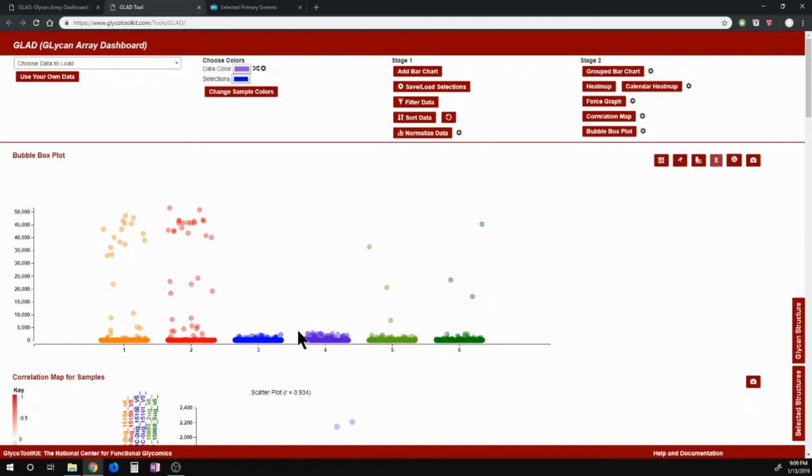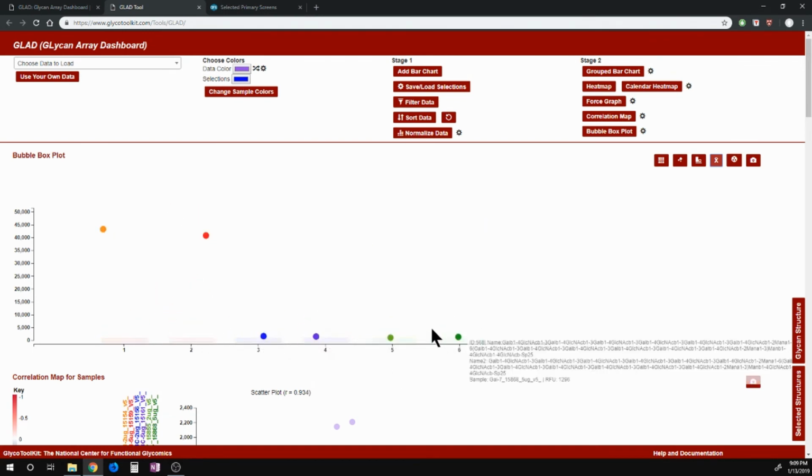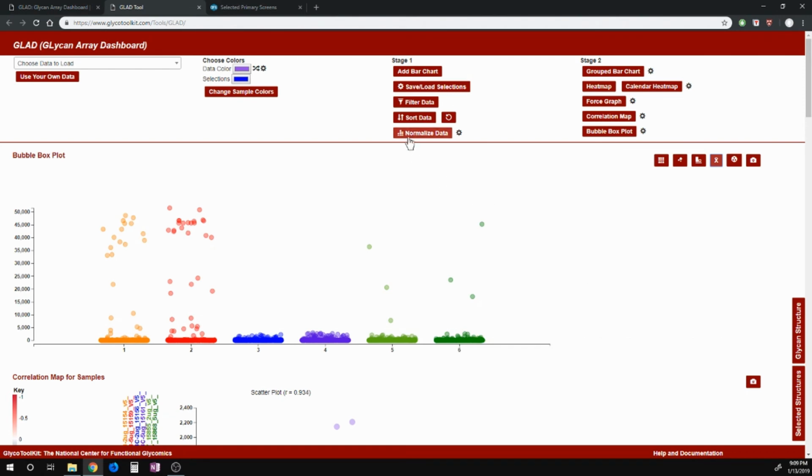What is clearly visible is that Galectin 3C binds the array with significantly lower signal as compared to Galectin 3 or Galectin 7. However, based on the previous analysis of both correlation plots and force graph, it could be that even though the binding is lower, the specificity is still maintained in that it resembles the binding pattern of Galectin 3 more than that of Galectin 7.